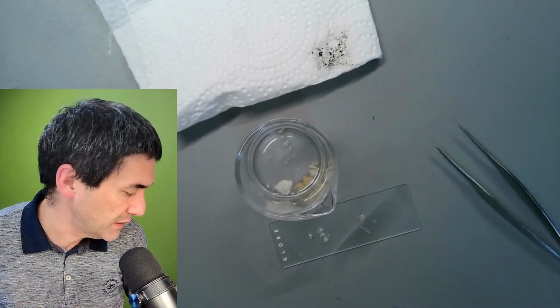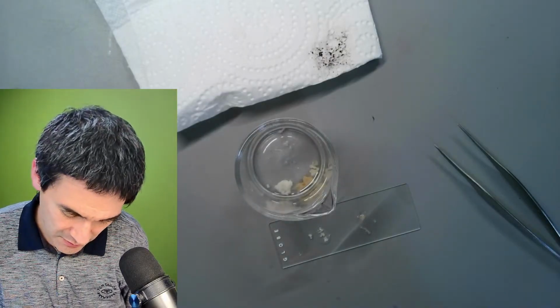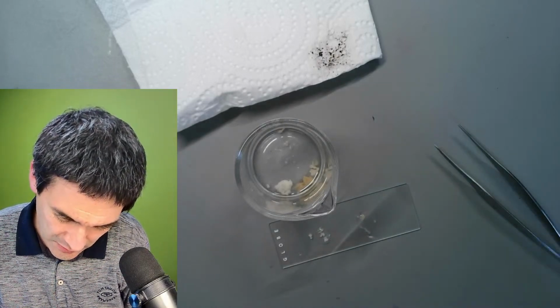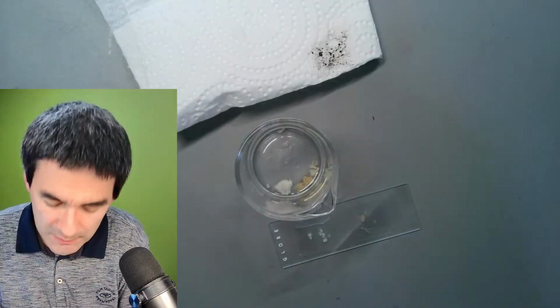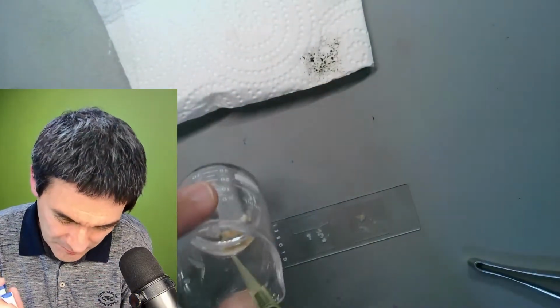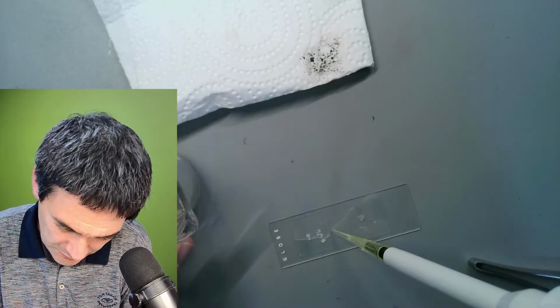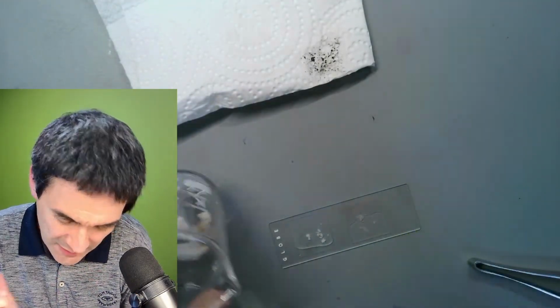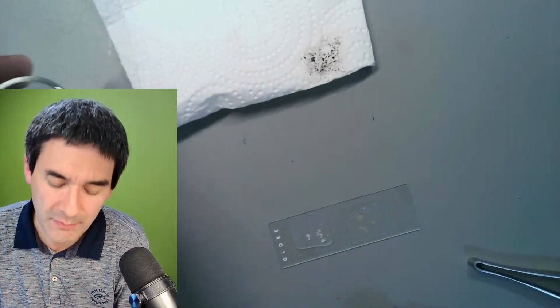Like everything, it does take a little bit of patience. So maybe we're not going to be so lucky. But a couple of months ago when I did that, with a little bit of patience, you were able to find all of these things. So this again is an example of it being way too thick. So I'm going to add a little more water. So let's maybe also over here. They're mixed together. I'm aware of this, right?